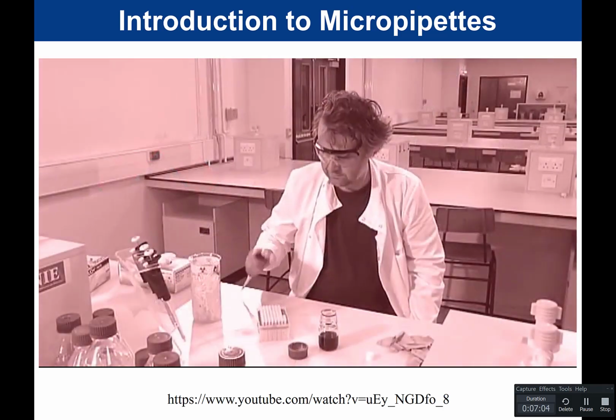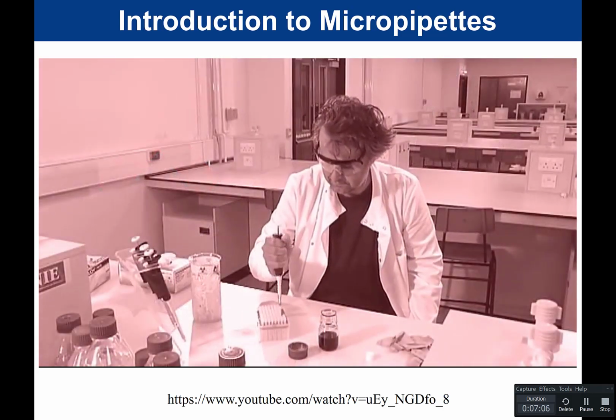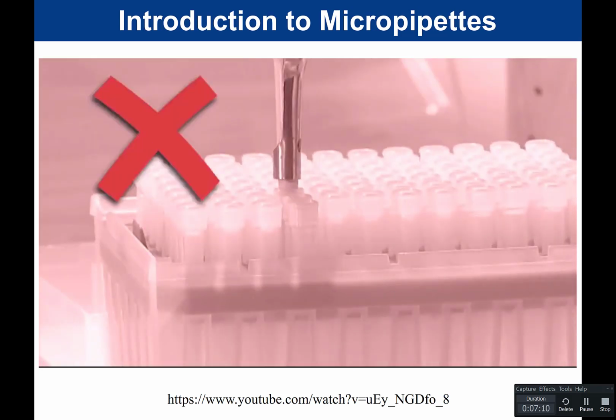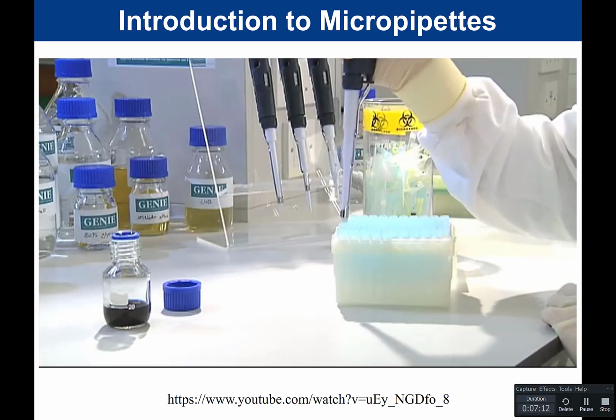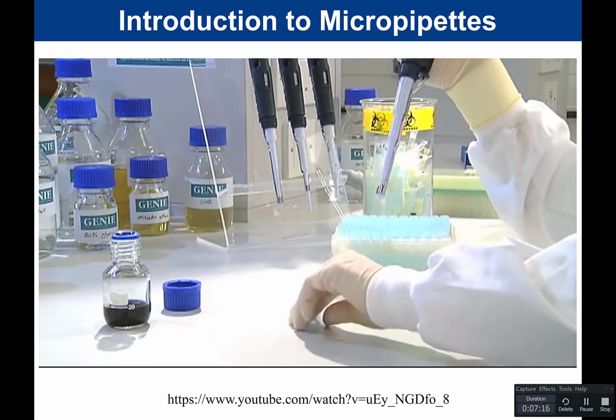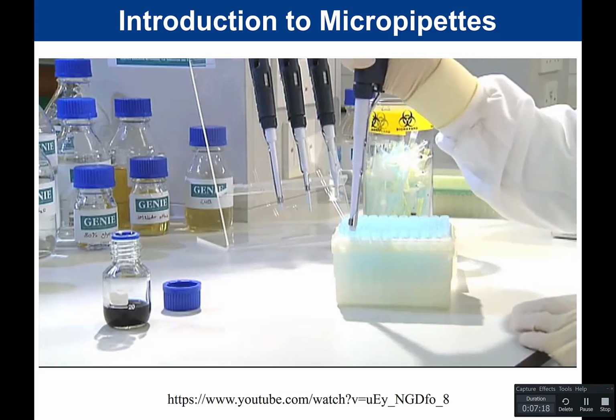If you're having trouble attaching a tip to your pipette, don't repeatedly jam the pipette into a tip. This can damage the pipette. And if the tip doesn't stay on the end of the pipette, simply repeat the procedure with a new tip.